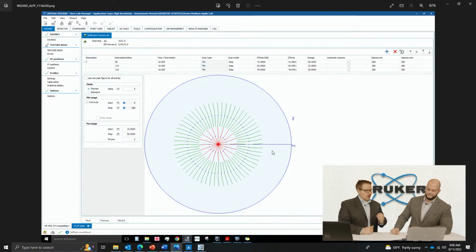And while we're talking about this, I guess one other thing just to clear out, there are different coordinates too. There's the machine, or the goniometer coordinate system. Right. And what did you say those two were in this case? You're looking at essentially the phi rotation of the sample. So phi is rotation. Yep. And then psi, which is your sample tilt. Okay, so tilt of the sample. Yep. But then when we actually analyze the data, in the end, we're going to get a different set called the Euler coordinate system. Right.